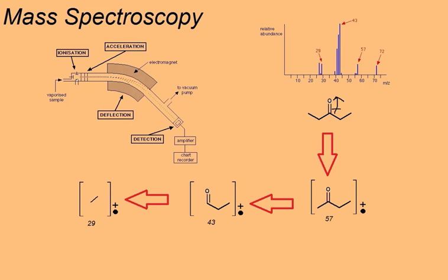So a polar covalent carbon to oxygen bond. And then the bonds around those polar bonds are themselves polarized slightly as the electrons are drawn towards the electron deficient carbon. So polar bonds break and bonds close by to polar bonds break.